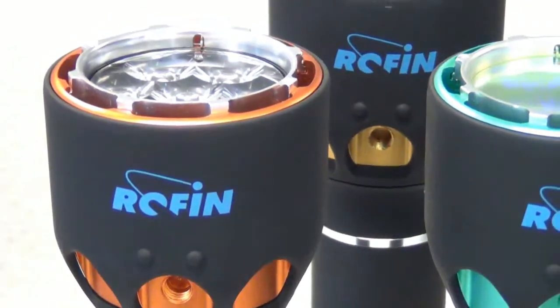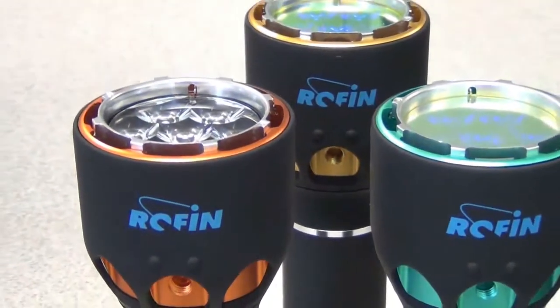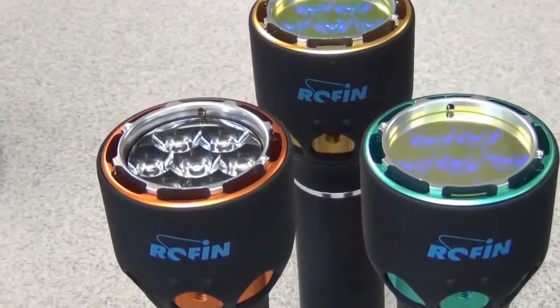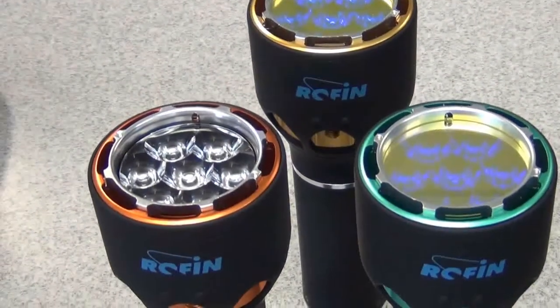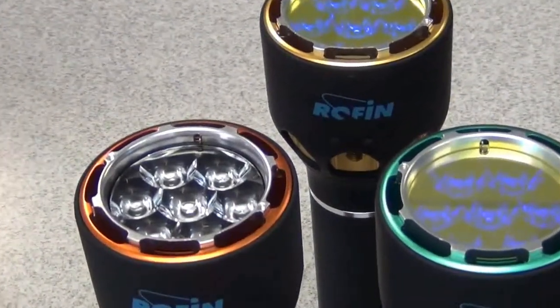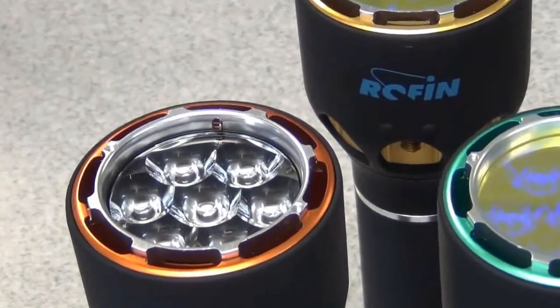Welcome back everybody. I'm now going to discuss the individual components of the PoliFlare Plus 2 forensic light sources. Firstly, of course, we have the globes, the LED globes, which is the most important component of any forensic light source.